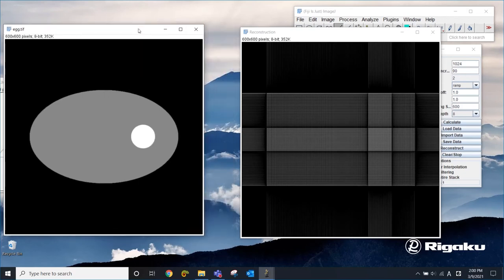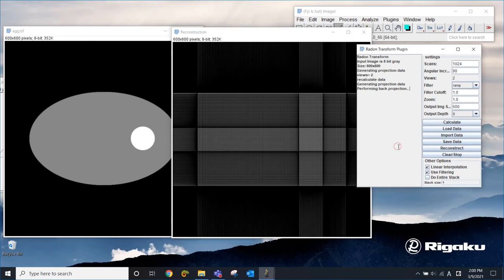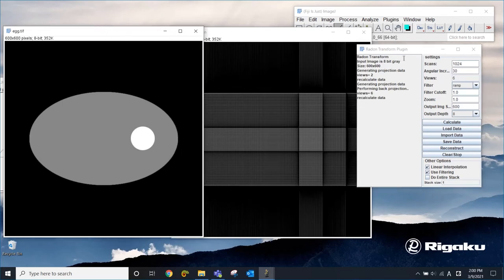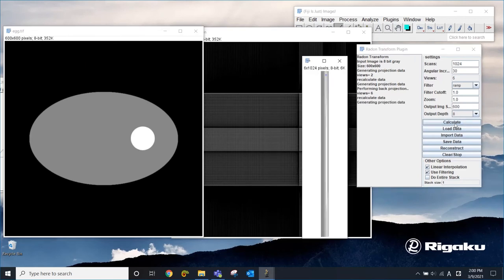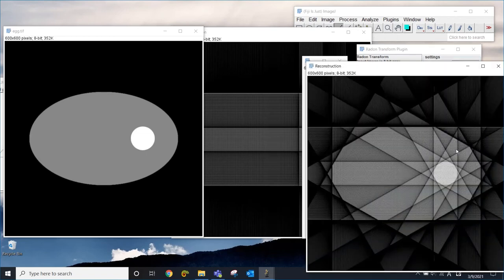This can be resolved simply by increasing the number of projections or decreasing the angular increment. Let's say that we're going to have 30 degrees. Now we will have six projections. Make sure that you choose the original one to calculate the projections. Now we have one, two, three, four, five, six projections. And then we're going to use this to reconstruct the original density.